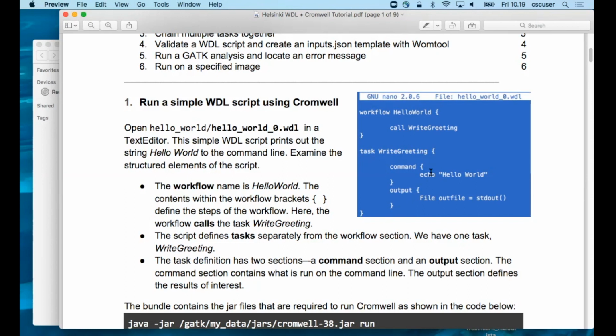So it created this hello world text, and basically it created a standard output, and that was taken into this output file. And the output file is what we looked at just now. Simple enough? All right. Any questions? Were you all able to look at your output file?